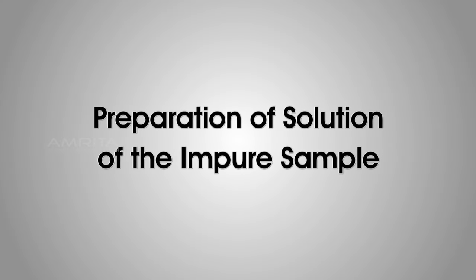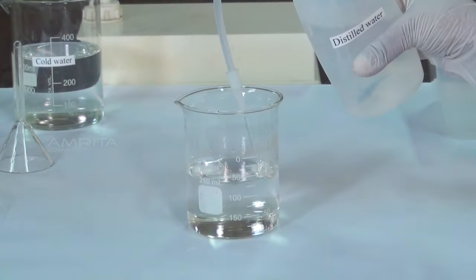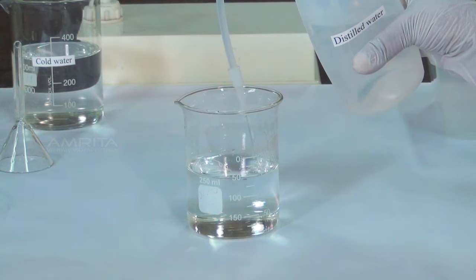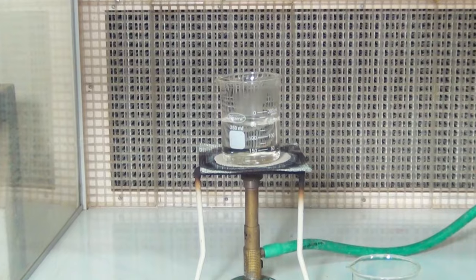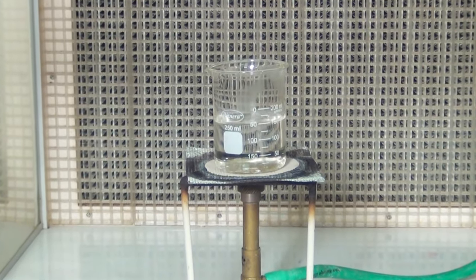Procedure. Preparation of solution of the impure sample. Take about 150ml of distilled water in a beaker. Boil the water in the beaker over the Bunsen burner.